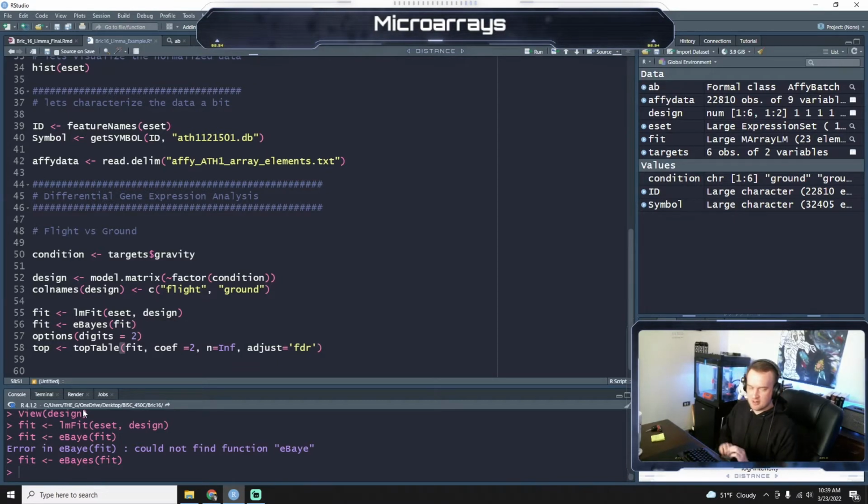I believe we talked about this previously, or maybe it was in one of the 10 attempts I tried to record this video before. But if we look at this Affy data, we have 22,000 different probes, right? And for each one of those we're running a regression. So if you accept a p-value of 0.05, what you're essentially doing is accepting 5% false errors, or false discovery rates, so false positives.